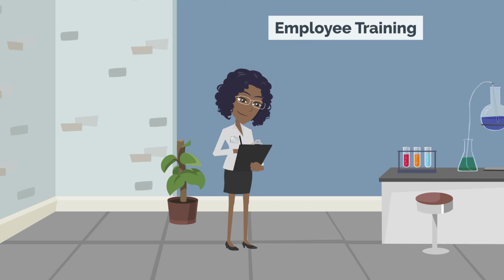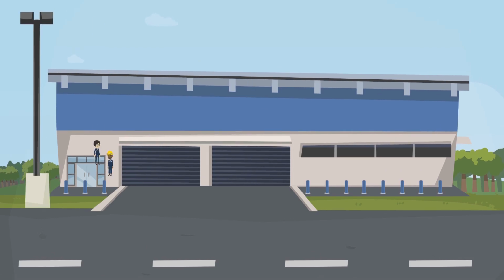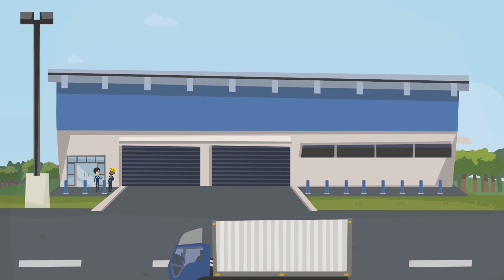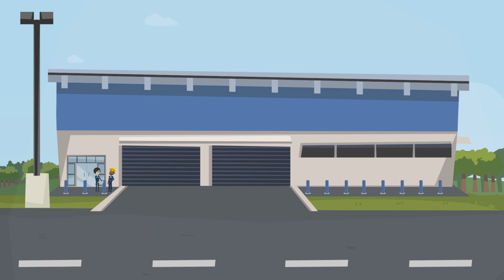Employees should be able to inspect inventory, maintain automated systems, and follow industry standards. Employees should also be familiar with their roles and responsibilities. So with a basic understanding of chemical inventory management systems, how might you implement one in your facility or institution? Let's think about the system in more specific terms.